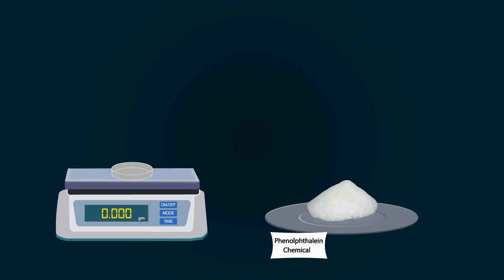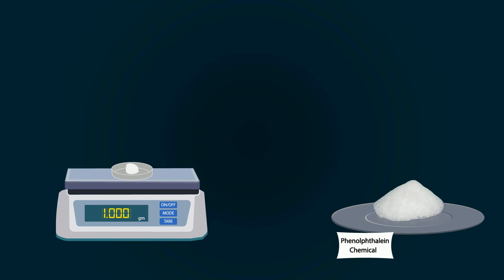Now take solid phenophthalein. You can put phenophthalein into the china dish with the help of a spatula, and measure precisely up to 1 gram.